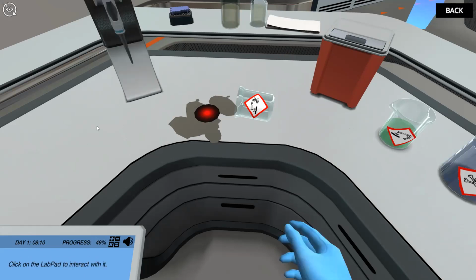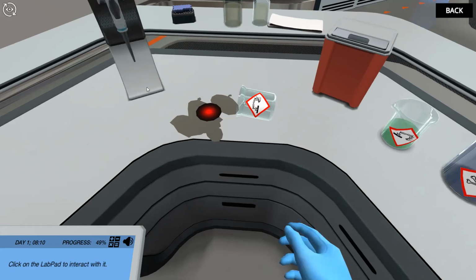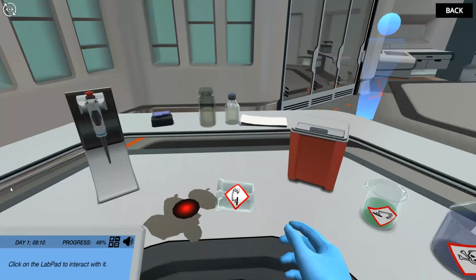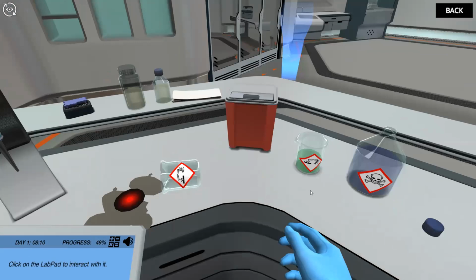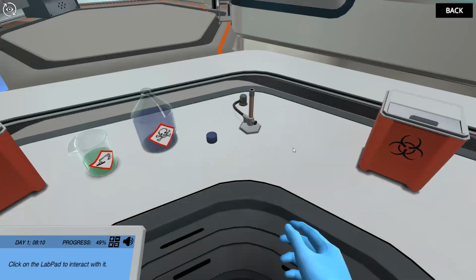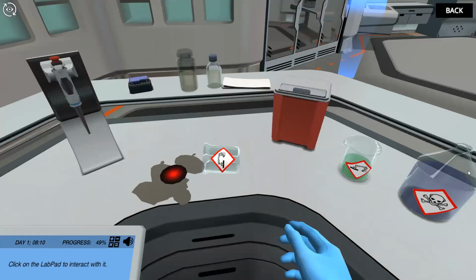Spills of strong acids or bases have to be neutralized before you can dispose of them. Sodium bicarbonate is the chemical term for baking soda. It neutralizes the acid, and the remains can be scooped into a plastic bin and discarded. Let's neutralize this acid spill.